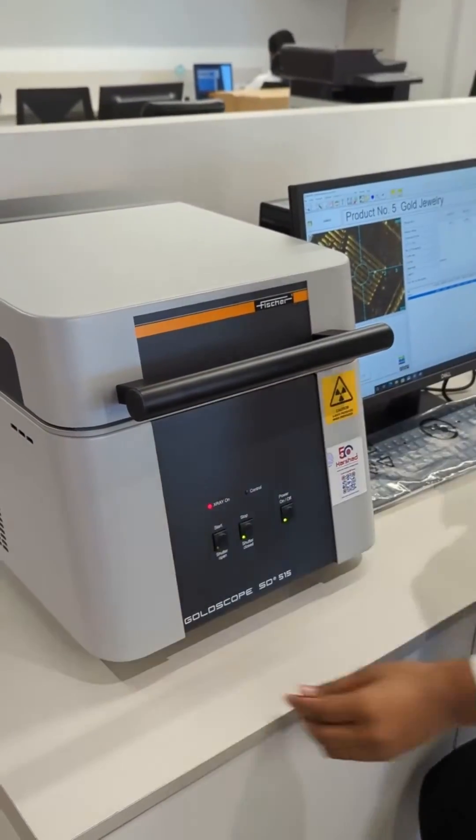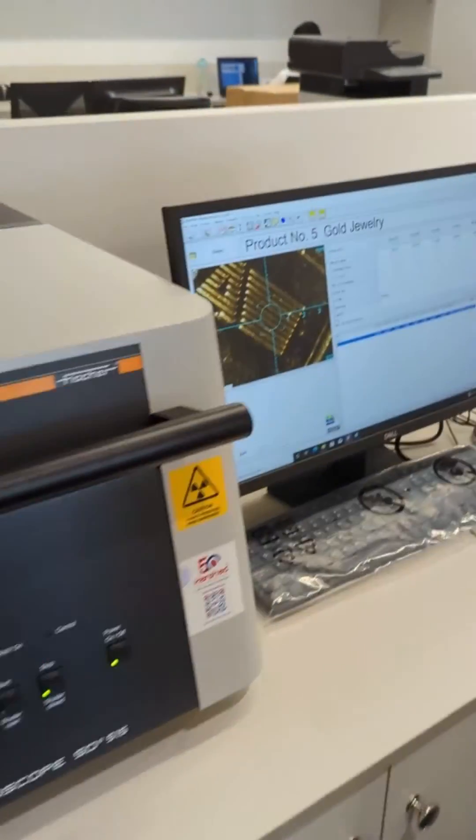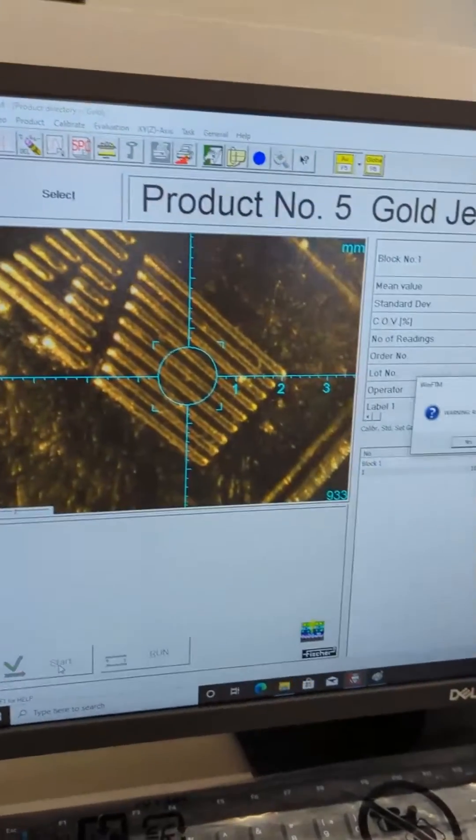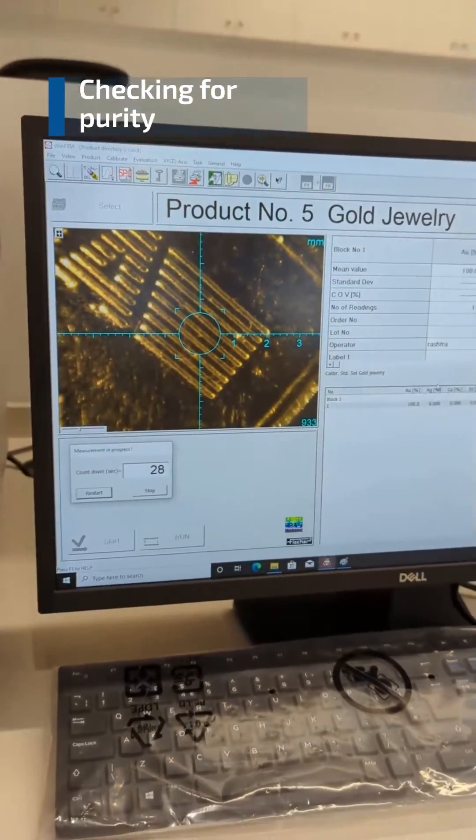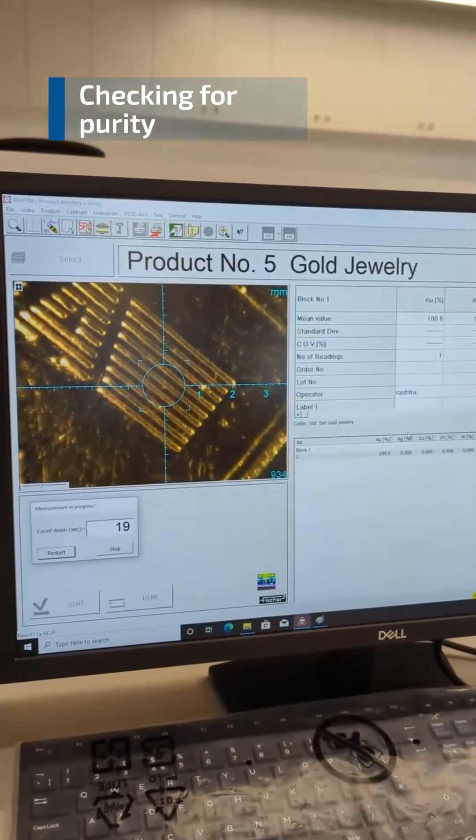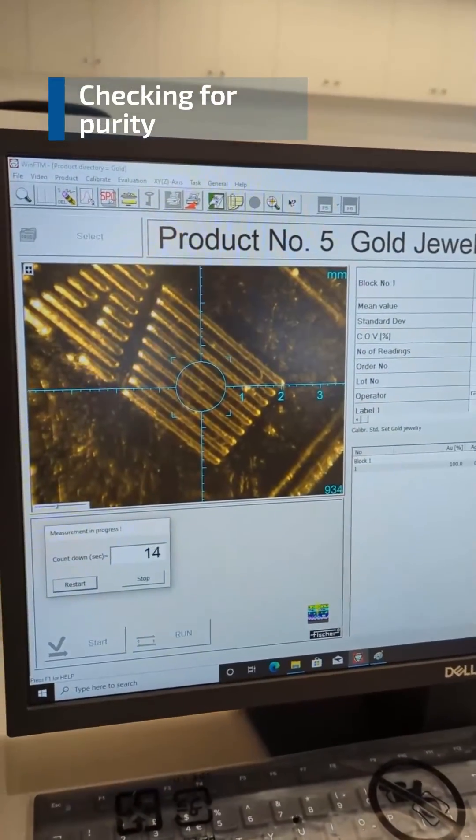Simply place the item on the measuring window in the measurement chamber and press start. A camera shows you the exact measurement spot and the results are displayed on a user-friendly interface.